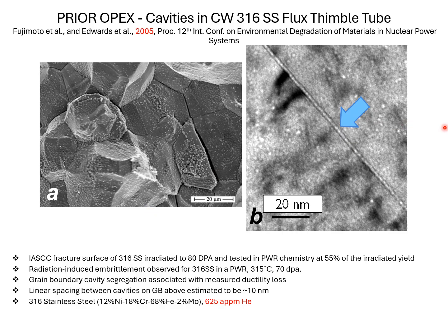Okay, so in the same vein, the interpretation of what causes fracture in steels and nickel alloys is fraught with difficulties, mainly because often, especially in power reactors where there's a high thermal neutron flux, it's often possible to get a lot of helium generated, even in steels, in particular in nickel alloys.